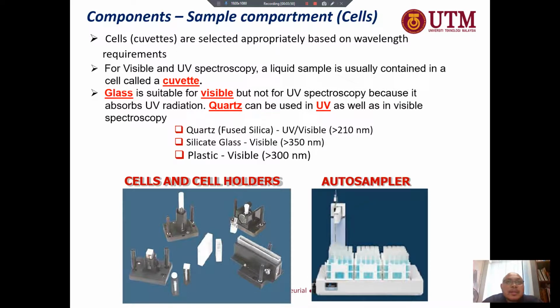Okay, for example, the forensic team has received a sample of a drug. Upon the initial investigation, they found the maximum wavelength of absorption of the particular compound is at a given value. Please describe how you select the compartment cell for the analysis.